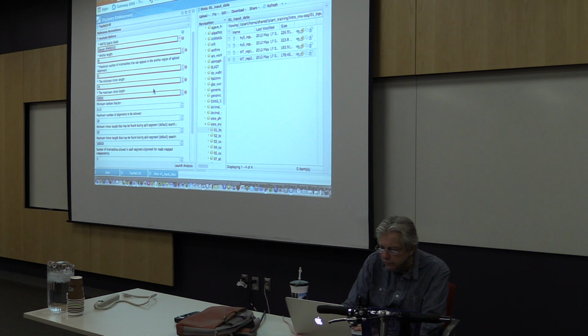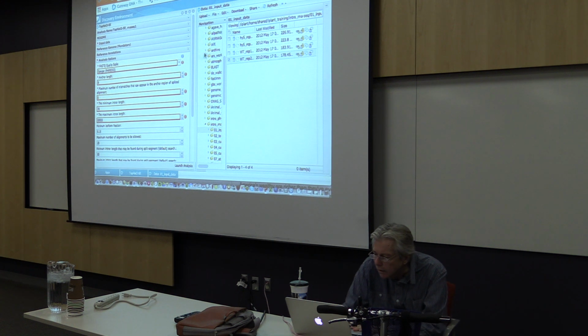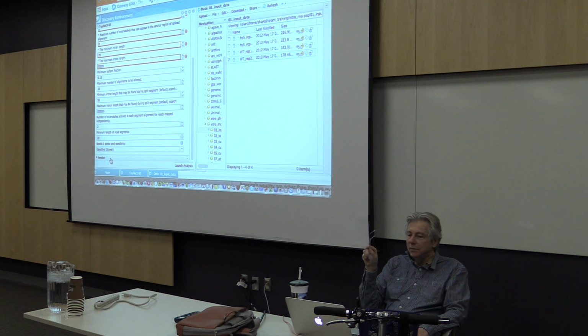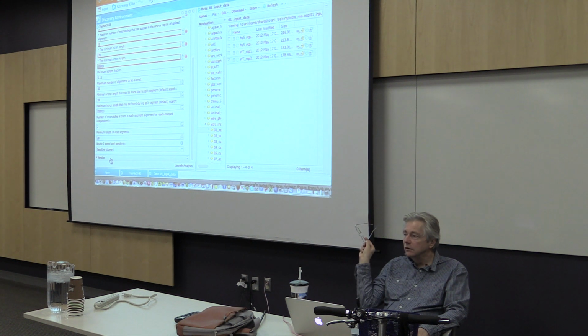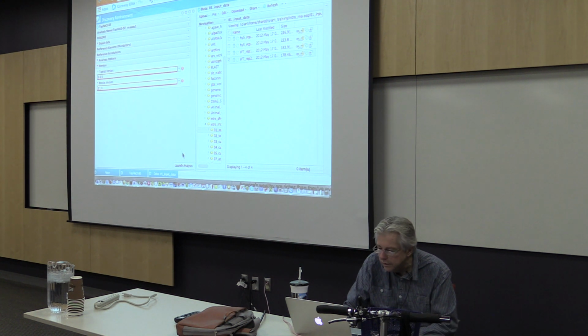I think we're using default settings here. I don't remember offhand if it's Phred 33 or 64. I sort of suspect it might be 64, but I don't think it matters in this case. It might be a little more accurate if we get that. And ideally, that's something you should know. But since we didn't do what we were supposed to do, that would put me in a bad situation with myself if I did it this way. Because, you see, I don't have the information offhand. But if I did what I was supposed to do and ran FastQC, one of the things it tells you right up front is what's the format of my read files. But in this case, for this application, I don't think it's going to make any difference.